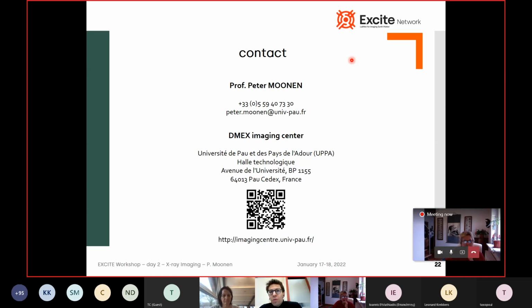So you can reach a higher resolution than if it would be a rock core, that's true, because the density is like half, but you will still need quite some time to reach a high resolution image. So it's on the time point that you will especially lose.